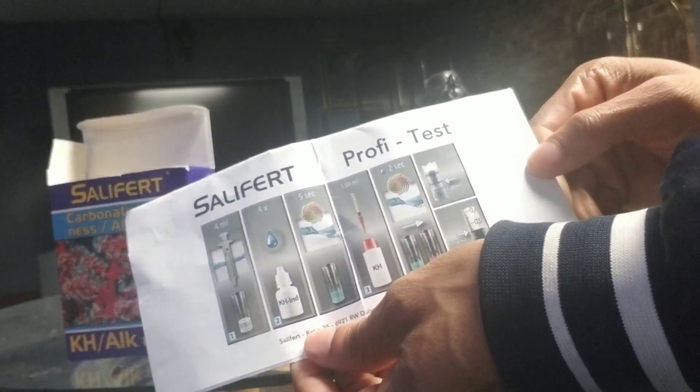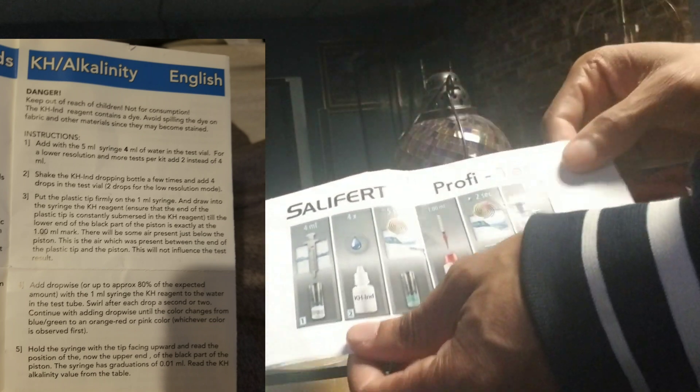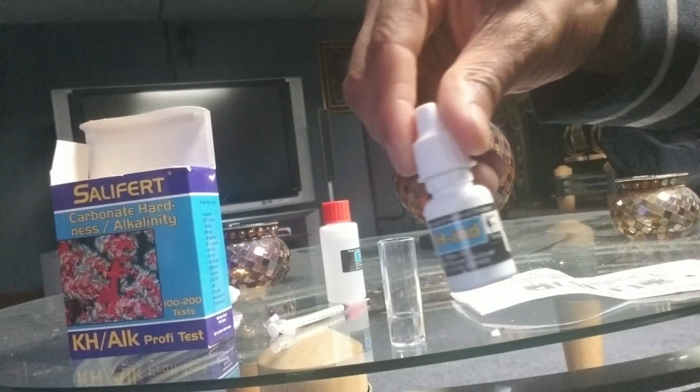What I like about the instructions is they are a lot better than they used to look. They now show how to do it step by step in picture form.